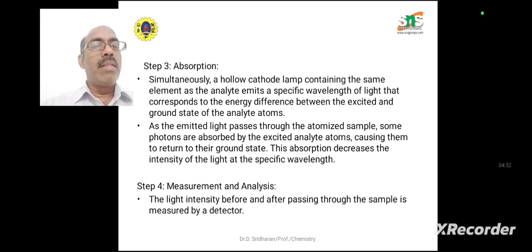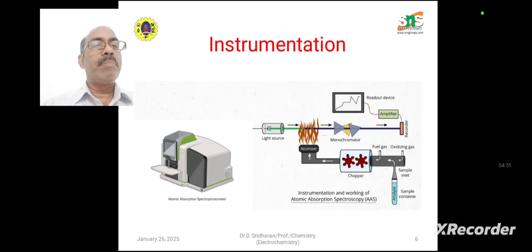This is followed by step 4, measurement and analysis. The light intensity before and after passing through the sample is measured by a detector.